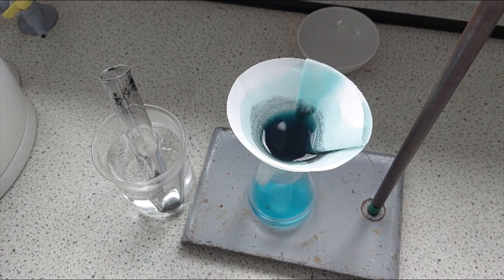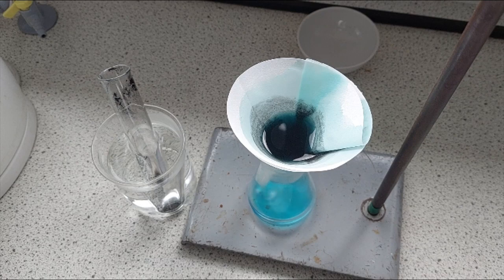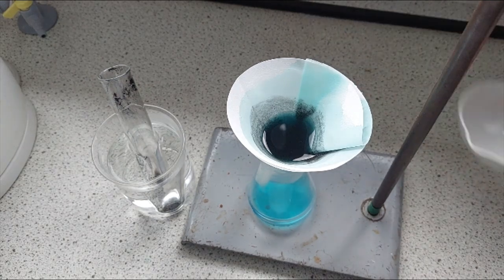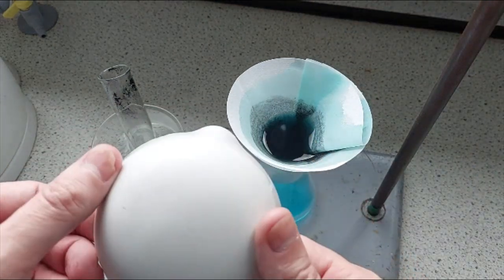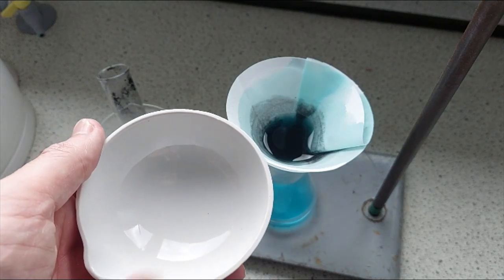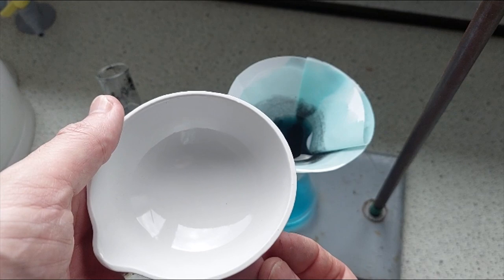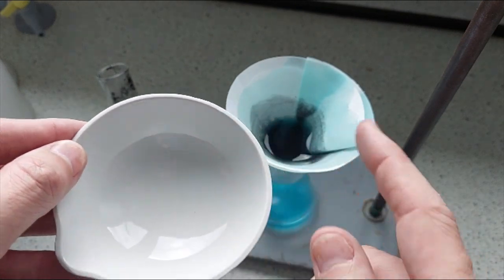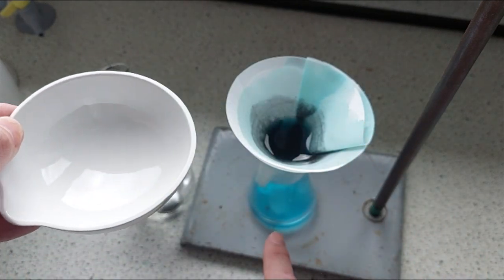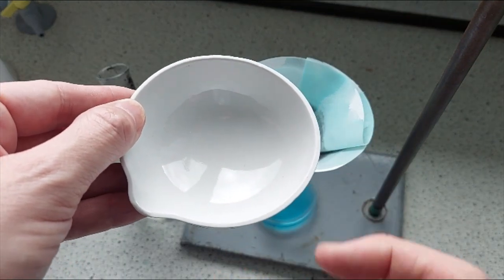And the final step will be to perform evaporation and crystallize the copper sulfate out of there. So to do that, we have an evaporating basin. You place it on top of a heat source. The heat causes any liquid in there to evaporate, and if there's anything soluble within that liquid, it will begin to crystallize. You'll get small crystals. So what we're going to do is, once this is fully filtered through to the bottom, I'm going to take that liquid, I'm going to pop it inside the evaporating basin and then heat it up, and then allow the crystals to form.